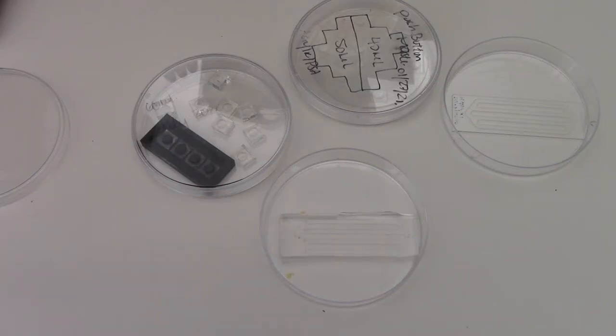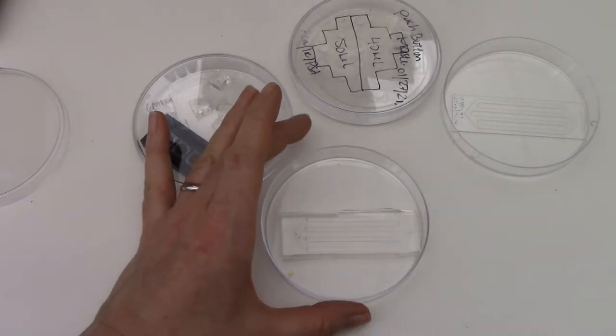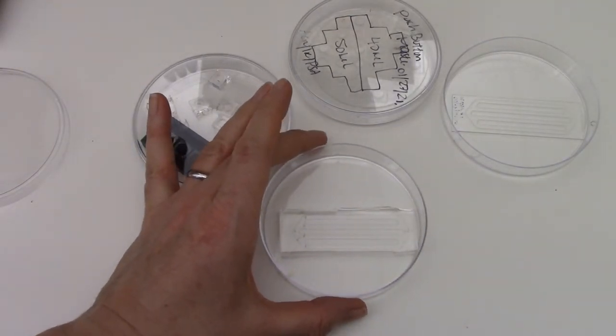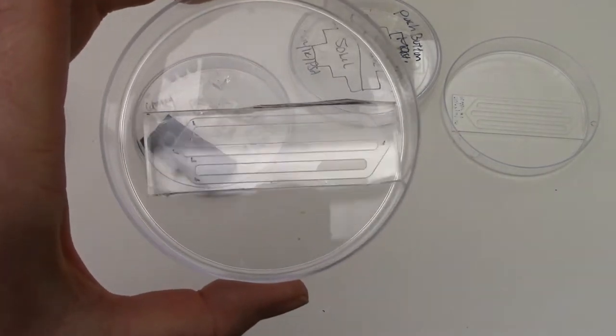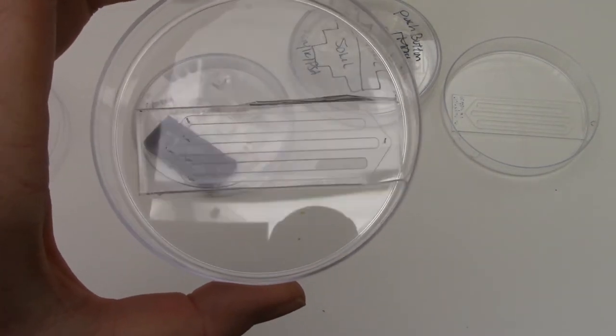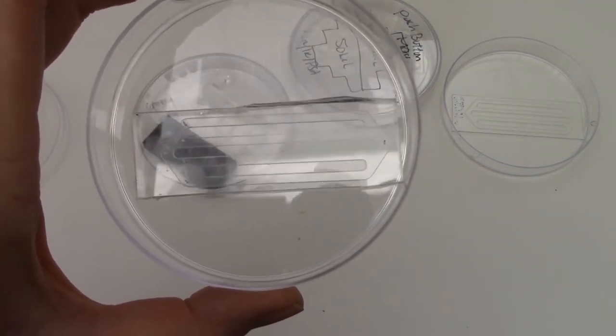Today we're going to show you how to make a PDMS microfluidic device. PDMS is a crosslinked polymer that is poured over a mold to make channels, microfluidic channels, in your device.